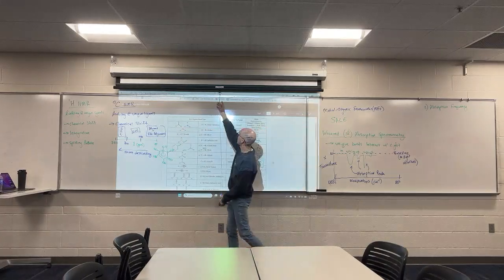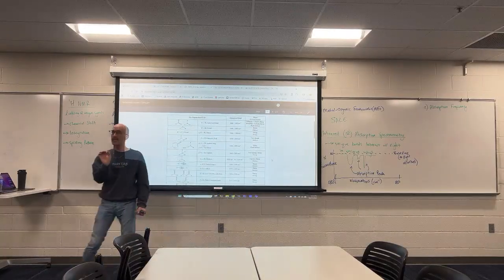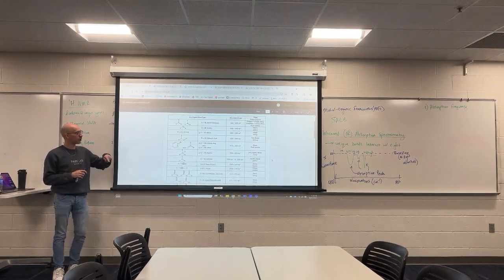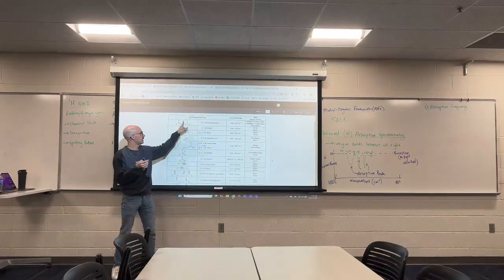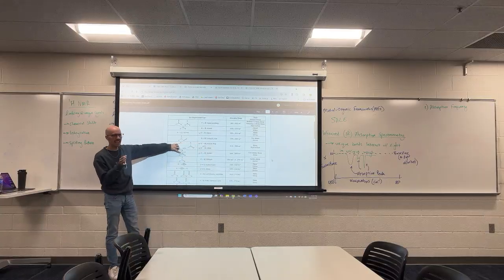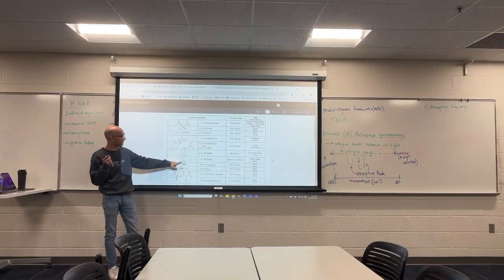You'll notice that on the left-hand side, we look at the unique bond type. And I mean unique bond type, which is why in your analysis assignment, if you're not specific enough about how unique the bond type is, then I will reject it and ask you to find the error, fix it, and send it back. Notice, I do have some things that probably could be fixed, like I say amine, but this is also true of amides anytime you have an NH. But notice that you have CH aliphatic, that's sp3 CH. That's unique from sp2 CH.